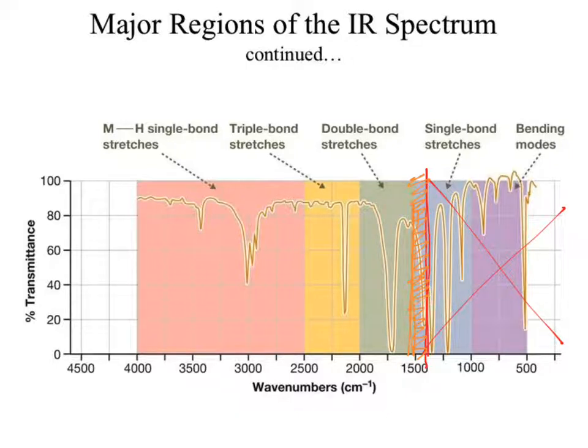Now how do we do it? Well, the textbook has you look at wave numbers. Where does it show up on the x-axis? Then we have something about the intensity of the signal. We also have something about the breadth of the signal. If I say I have a really large friend, what does that mean to you? He could be tall, but he could also be short and 800 pounds. That would still probably qualify as large. So our definition of those words becomes very questionable because we're making assumptions.